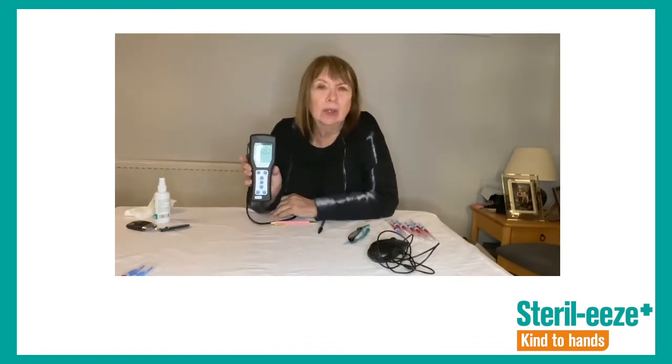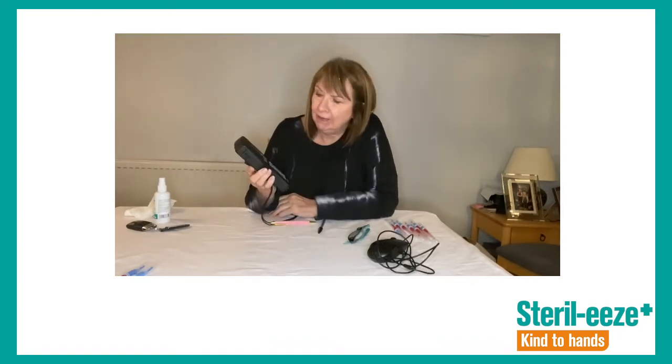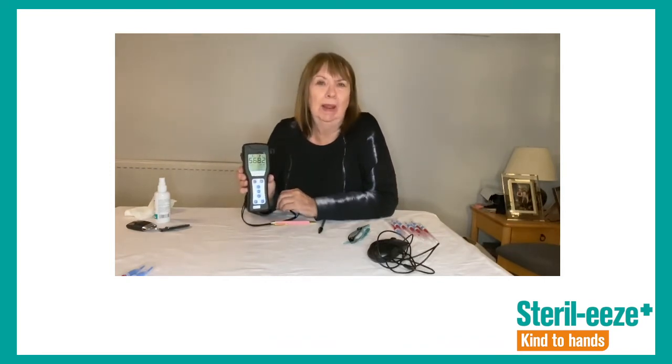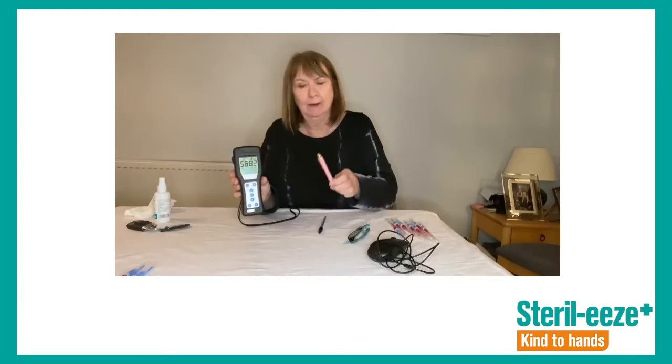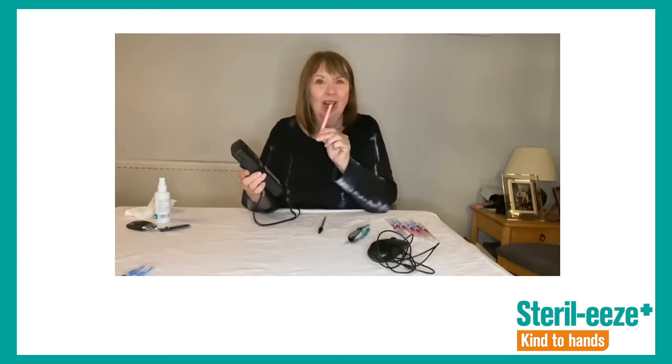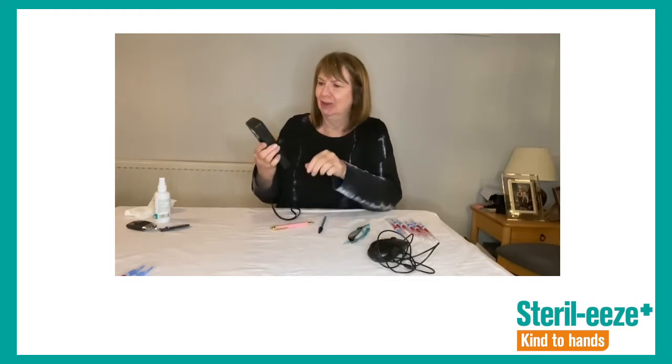On this occasion, there are 5,682 organisms present on this pen. That's very heavily contaminated. And just imagine if you're putting that in your mouth. That's nearly 1 × 10 to the 4, it's nearly 10,000. Oh, lots and lots of bugs. 5,682.